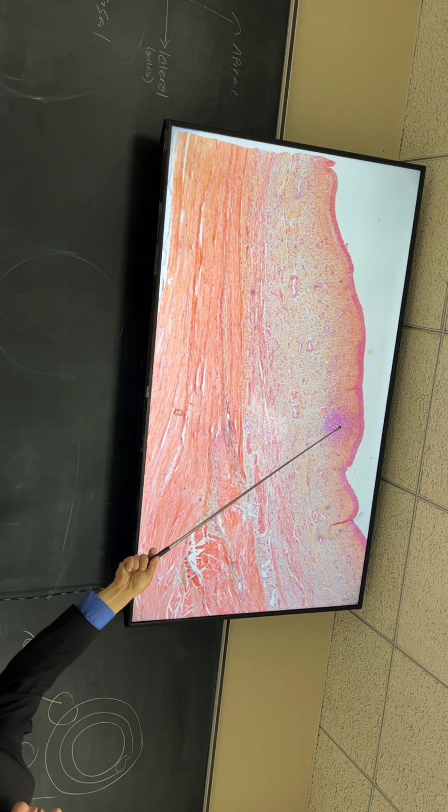At the very top, that cluster. That thing? What is that thing? A gland. I don't know. It's weird looking. What is it? It's different. Zoom in on it. Zoom in on it? Sure. You want to take a closer look?